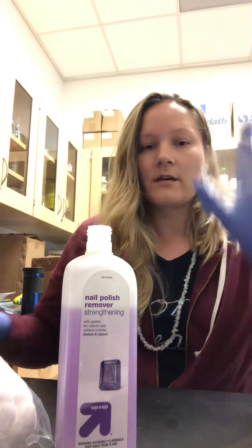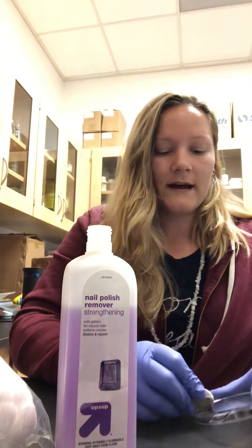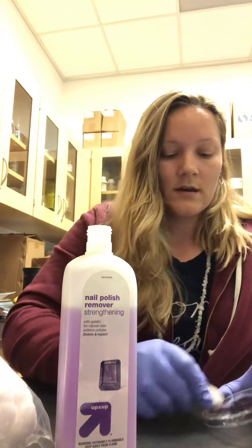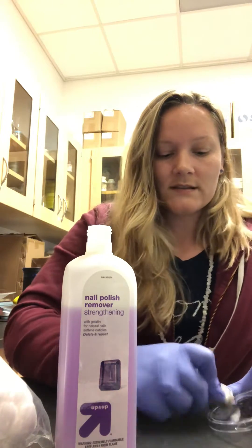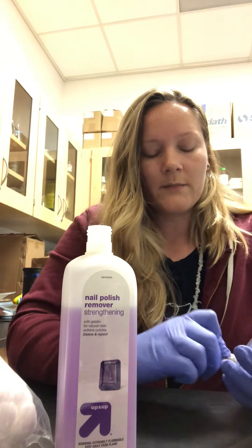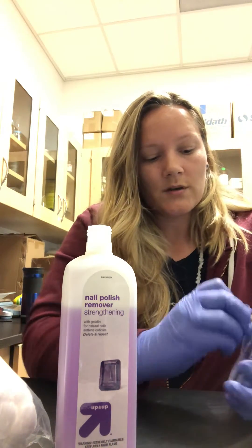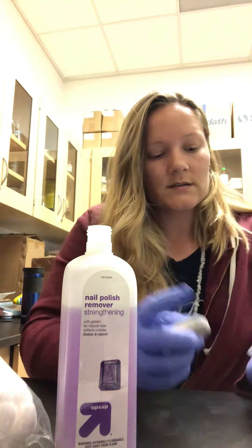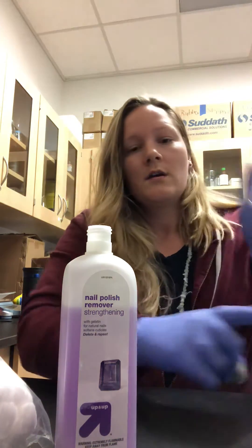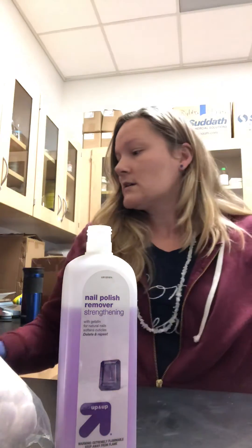Another hack — and again, the key is immediately after class — you can use an eraser. You can erase wax pencil markings off a plastic petri dish using an eraser, and you can remove sharpie markings with an eraser as well, but the key is immediately after class.